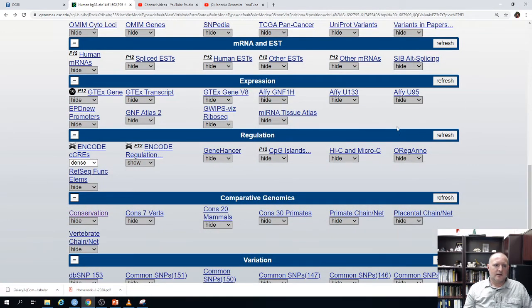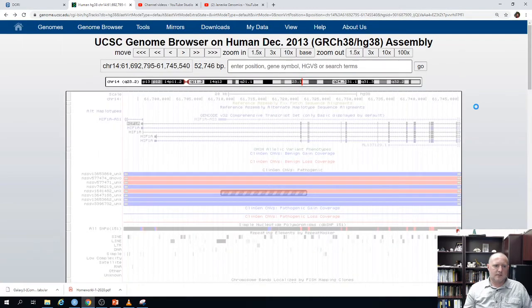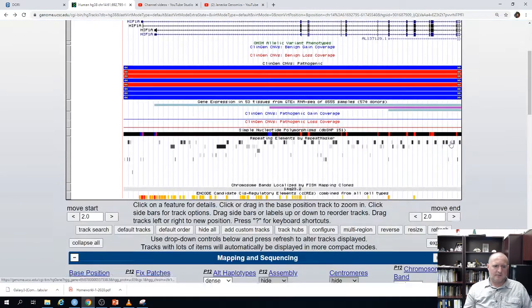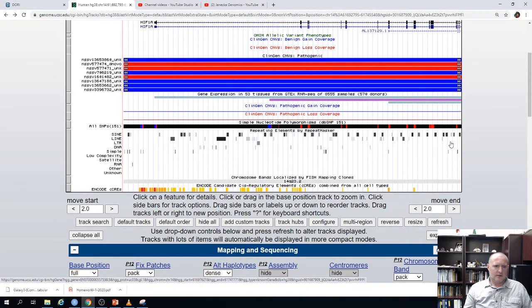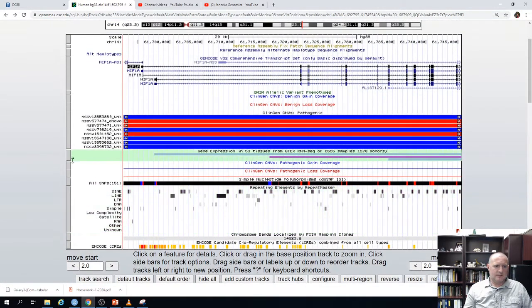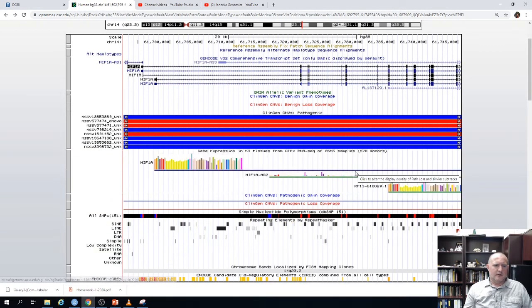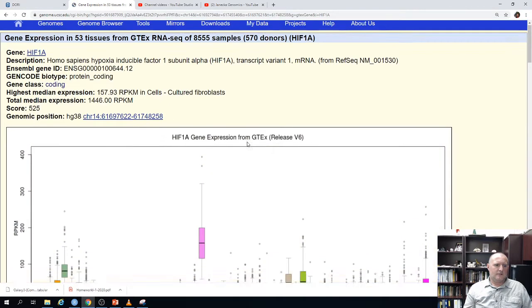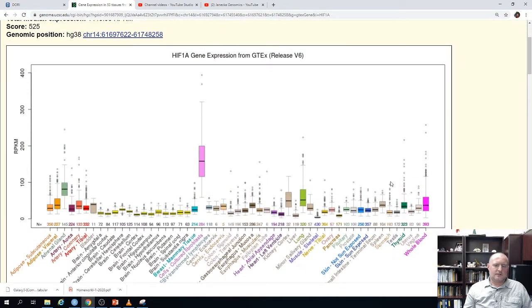There's also an mRNA expression track. If I set it to squish and show the expression data for this gene and then expand it, here's the expression data. If we click on it, we go to a figure showing where this gene is expressed, giving us an idea of the expression patterns.